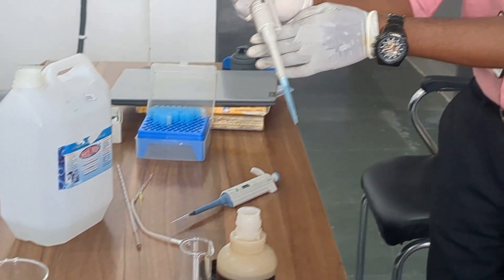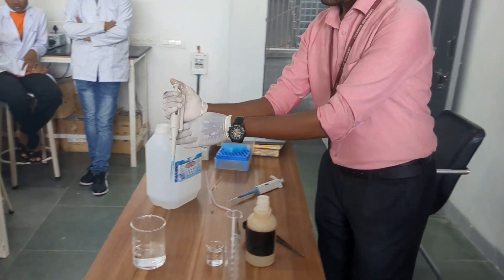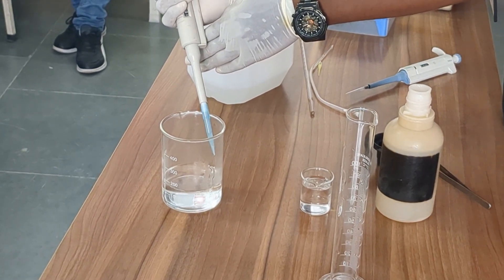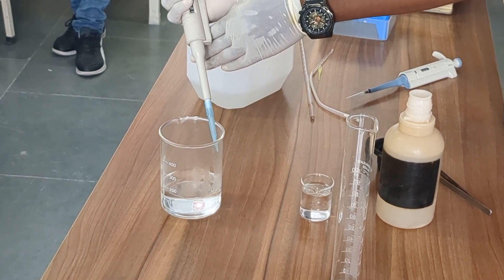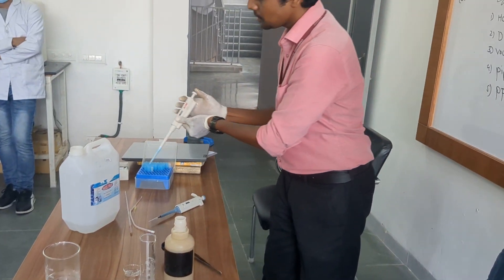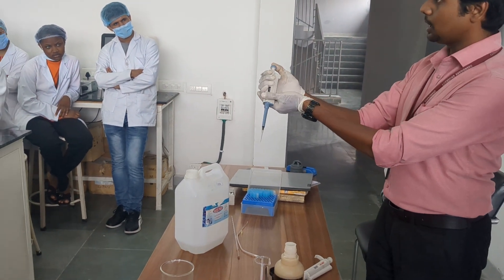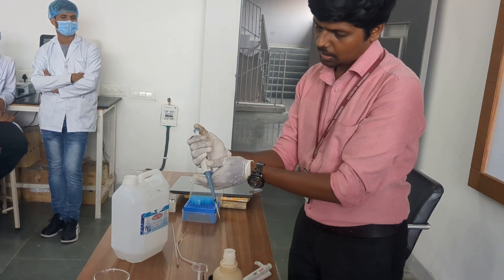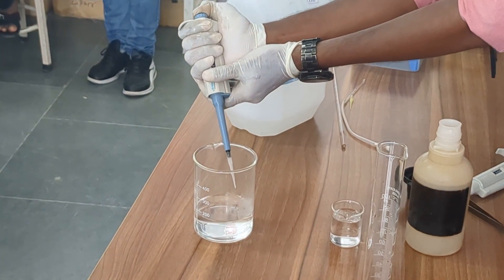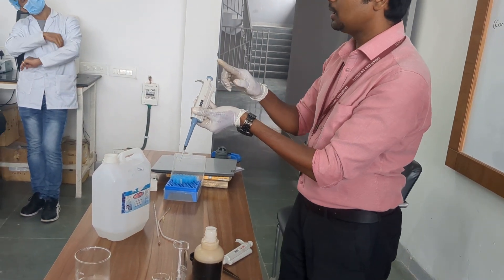Always add the acid from the side like this — if you add directly it might cause a reaction. I have added 1 ml, now adding one more ml. You can see it is reacting — can you also see the fumes? So 2 ml added so far, then I need to add 0.08 ml, which is 80 microlitres. I will first take 50 microlitres then reset to 30, so 50 plus 30 equals 80. Note: we have contaminated these micropipettes and need to clean them properly after the practical.